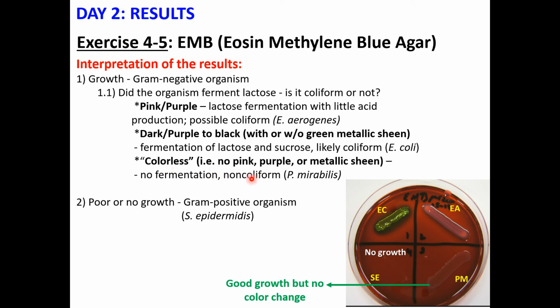And that's how we know that the interpretation of colorless would mean that this is not a coliform. So it's not an infection from this one, okay?